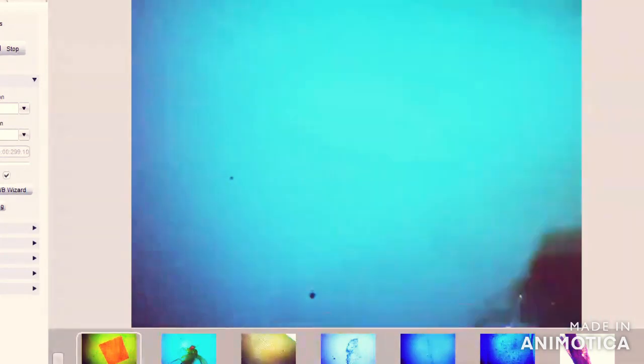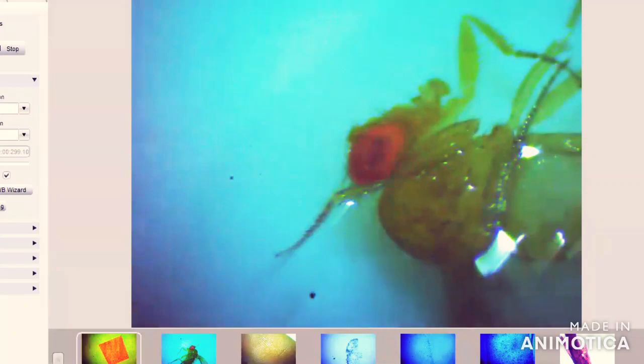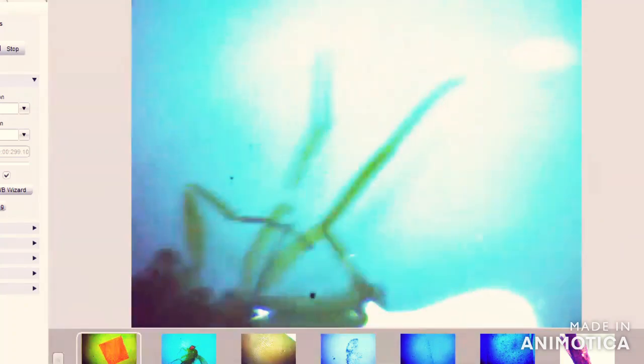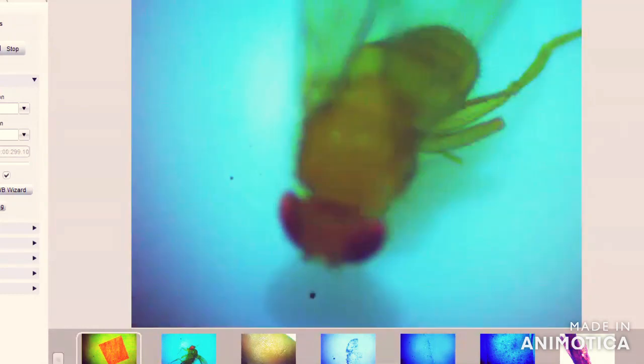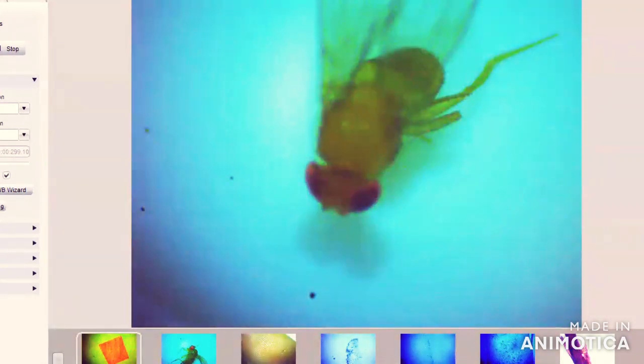In case of a male Drosophila, they have a sex comb on the first tarsal, the first thoracic legs. So this is the basic information about the Drosophila, about their lifespan, their feeding habit. This will help you understand this fly to culture and for further research. In coming videos we shall be talking about how it can be used for further different multiple research work. For today, it's all. Thank you so much.